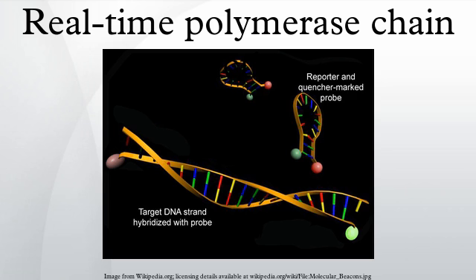This is because, despite being a kinetic technique, quantitative PCR is usually evaluated at a distinct endpoint. The technique therefore usually provides more rapid results and/or uses fewer reactants than electrophoresis. If subsequent electrophoresis is required, it is only necessary to test those samples that real-time PCR has shown to be doubtful and/or to ratify the results for samples that have tested positive for a specific determinant.